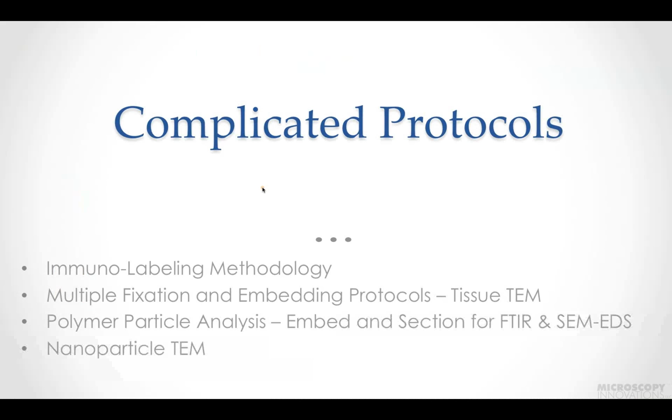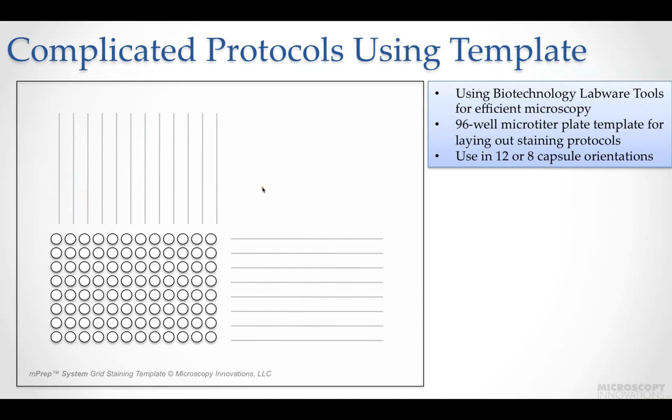And now let's take a look at some complicated protocols. So what do I mean by complicated protocols? Protocols that have a lot of different steps and require very great attention in order to track them, and where one has many specimens that are prepared in different ways.